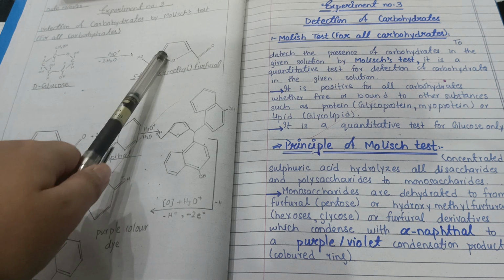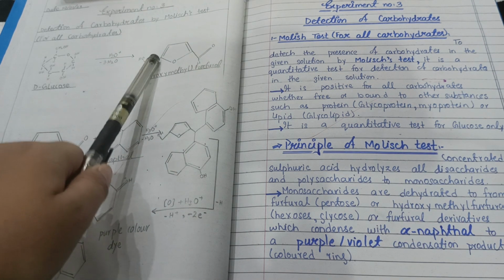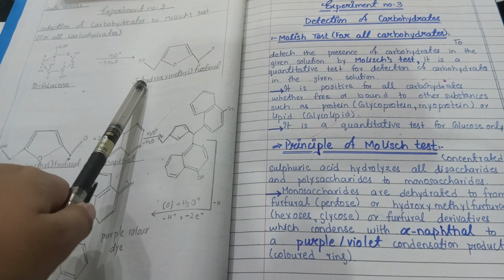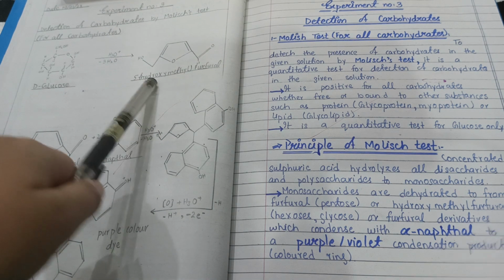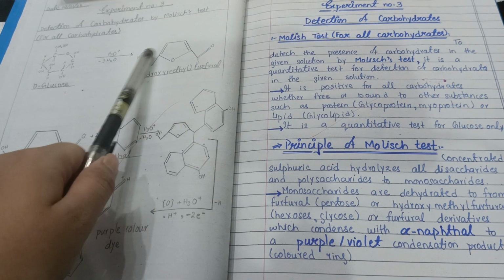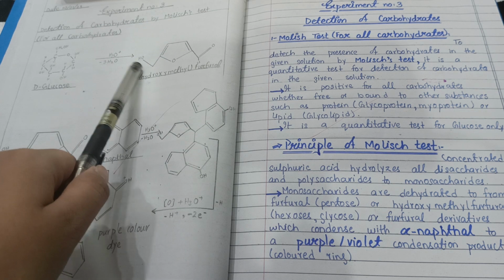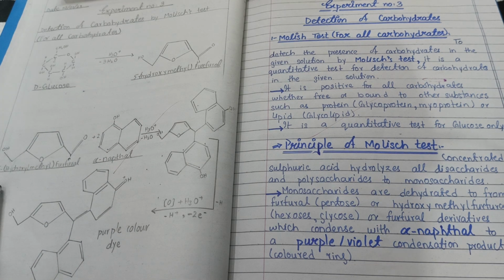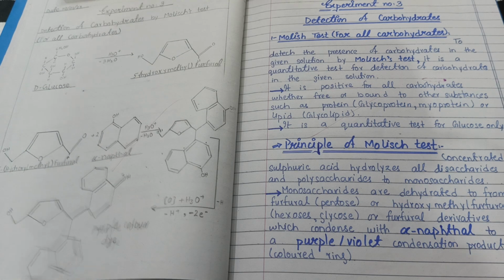Now we are going to add another carbon atom, because furan consists of only 4 carbons. We add a fifth carbon, and on that carbon we have the hydroxy, the OH group. So from this we obtain 5-hydroxymethyl furfural. Furfural is this group. Now we attach a fifth carbon to the furan ring, and after the fifth carbon we attach a hydroxy group to it.